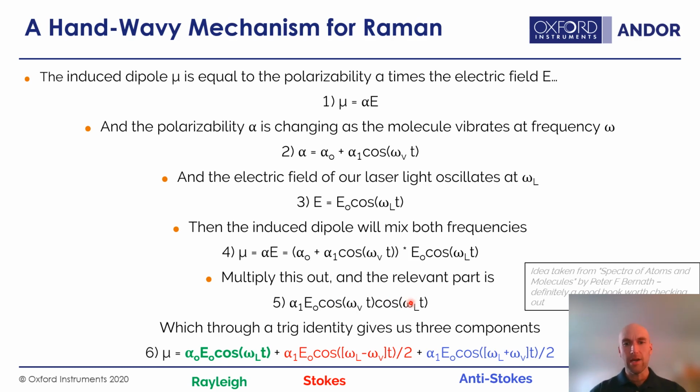If you imagine a visible light laser, that wavelength is very, very large compared to a molecule or a tiny little scatterer. So I imagine myself, I'm a molecule, I'm in the electric field of a laser that's being aimed at me. I don't see wiggles. I see this electric field around me going up and down with time, changing direction. So you experience kind of this bath of that. This molecule is in a time varying electric field. It doesn't necessarily know it's from a laser.